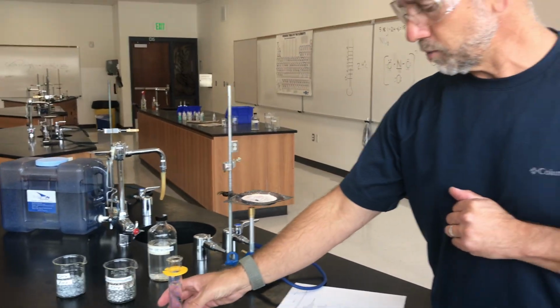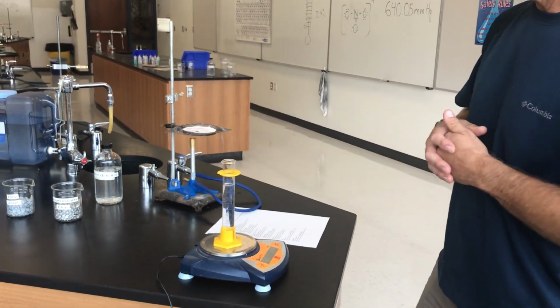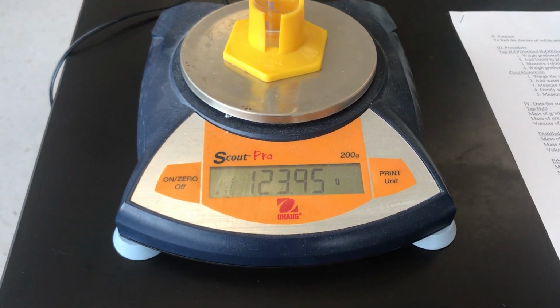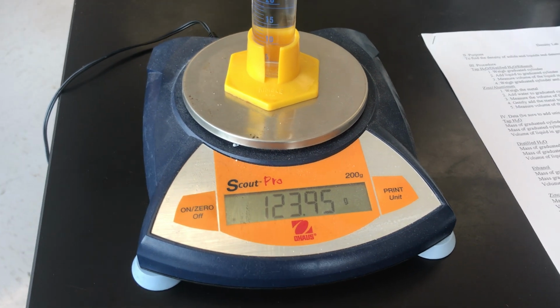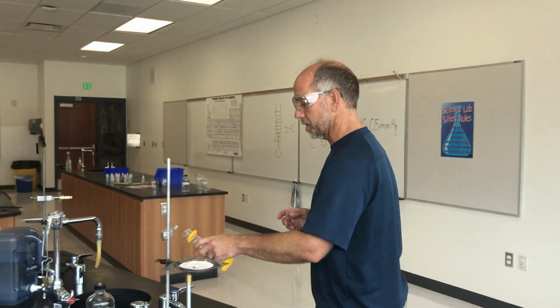Now that we're done with that, we simply need to come back, re-zero the balance one more time, place the graduated cylinder with the water on the balance, and from there you can record the final mass, which is all of the data that you need in order to figure out the mass and therefore the density. So we're now done with our tap water trial.